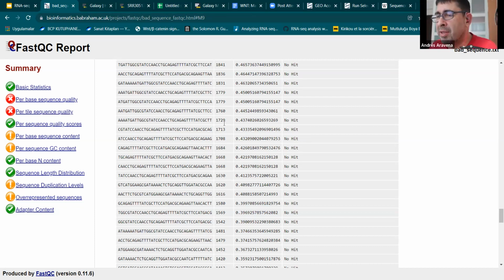Yes. But I have a comment here. First, we are speaking here about the quality of the reads, which includes several things, but starts with the quality of every base pair. It is the quality of the sequencing. And in sequencing, quality is something that is well defined. It's essentially something like the log of the probability of error, or proportional to that. It's an integer number, 10 times the log in base 10 of the probability of error, something like that.